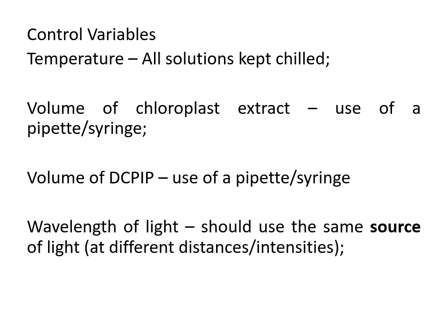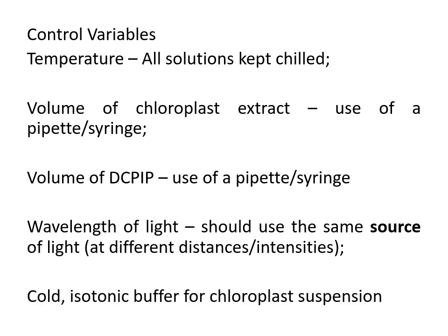Wavelength of light. We know that chlorophyll absorbs different wavelengths in different amounts, so we're going to use the same source of light, so the same lamp. And then also we are going to ensure that our chloroplasts, which are suspended in solution, that solution is a cold isotonic buffer, and why that is important.